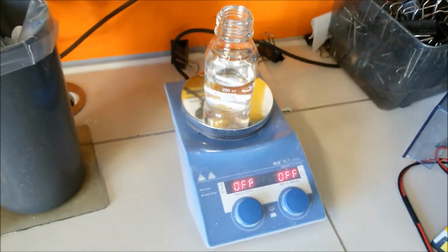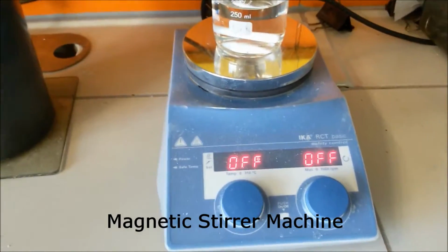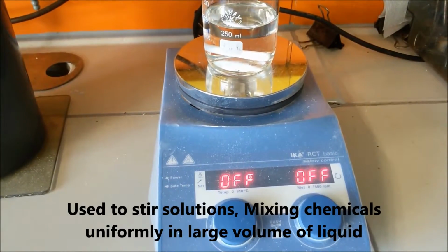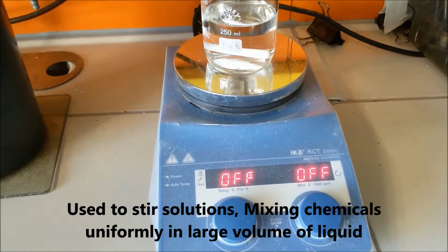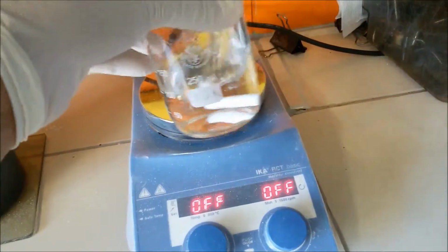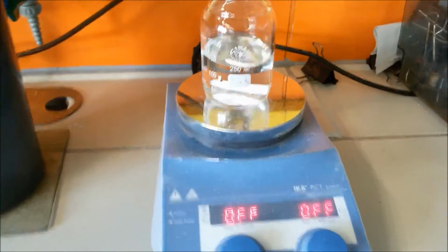Guys, now I will show you something else. This is a magnetic stirrer machine, and we use this machine to mix some chemical or anything using it with the help of a stirrer. So we don't actually take the bottle and shake like this.